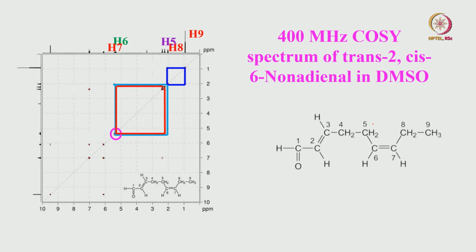Afterwards 6, it has to be 5. Then 5 has a cross peak coupled to 4. This has a cross peak here, and these two are not resolved. Again, it is poor. You can carefully see there is no resolution at all here. There are two peaks overlapped here, and you are not going to see them. As a consequence, you do not see it, but there are peaks here. So, that must be 4. 5 is coupled to 4.